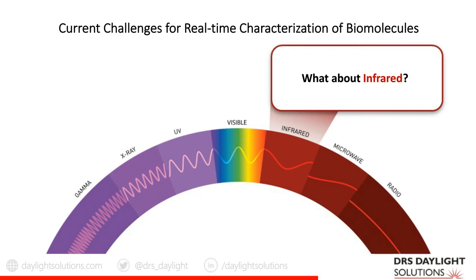Typically infrared, or more specifically mid-IR, is referred to as the fingerprint region of the spectrum for characterizing the vibrational states of biomolecules and small molecule conjugates. Mid-IR is useful for probing amino acids, nucleic acids, proteins and peptides, saccharides, and even reaction monitoring of peptide synthesis and bioconjugation reactions in both aqueous and also organic solvents.